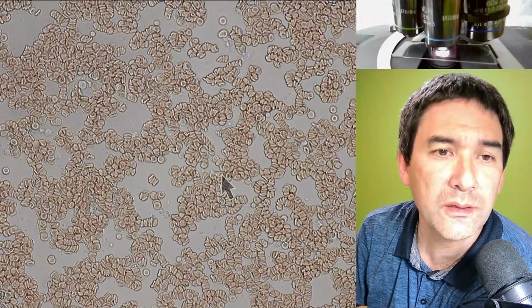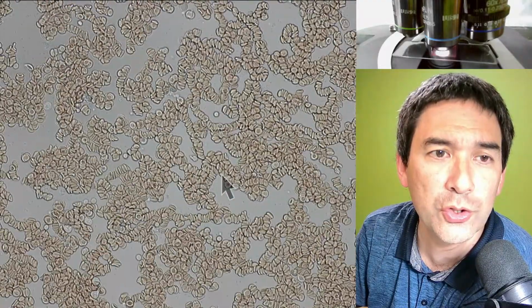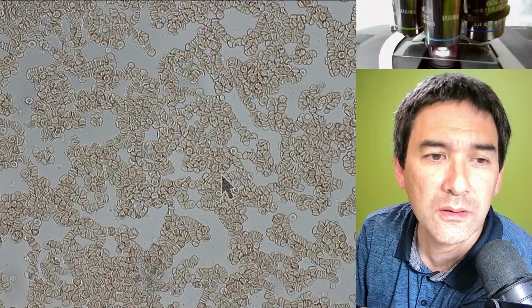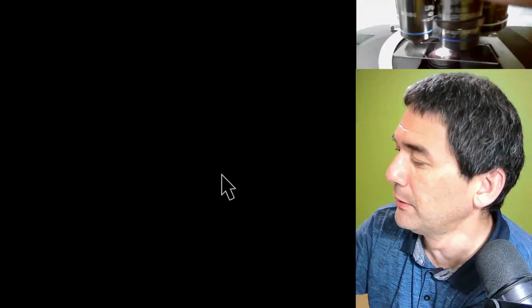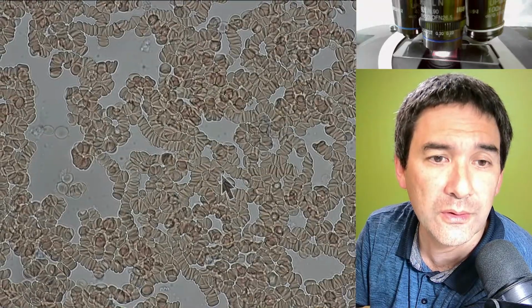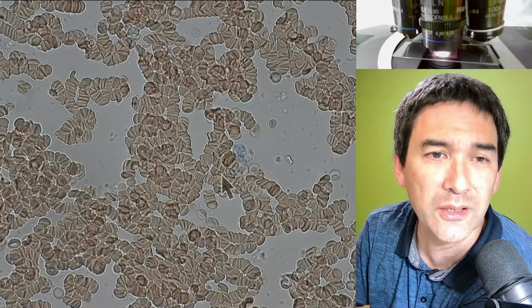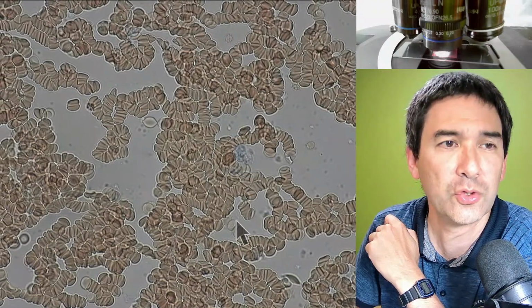In any case, the ink does not seem to have impacted so much on the shape of the red blood cells. But if I look at this, I'm not seeing any blue stained. And the movement is, of course, because of the capillary action and the evaporation of liquid. Look, this one looks a little bit bluish, but not really very well.